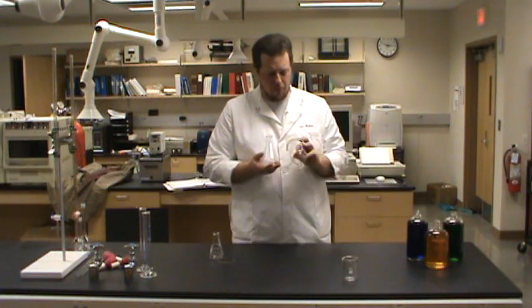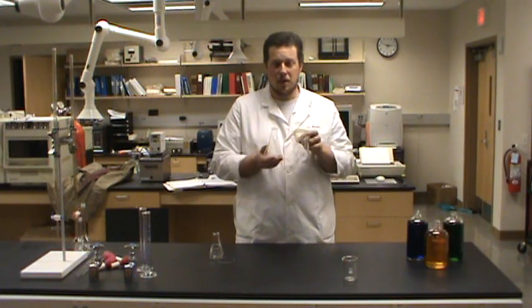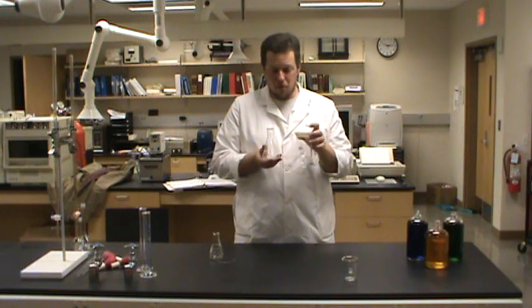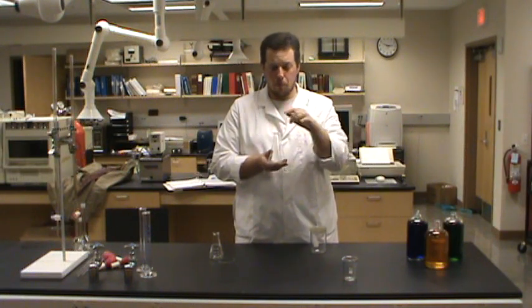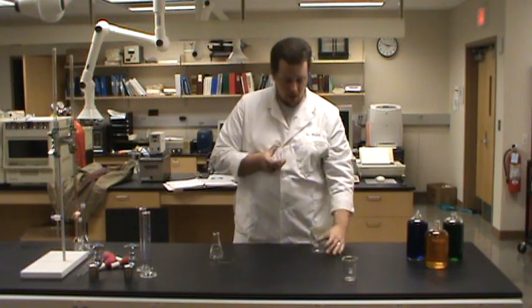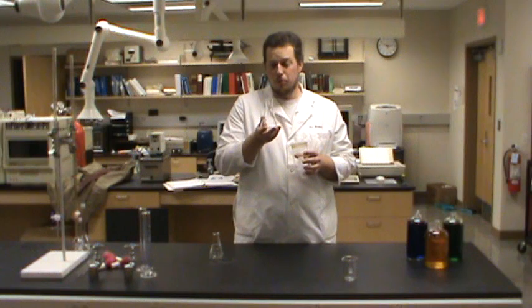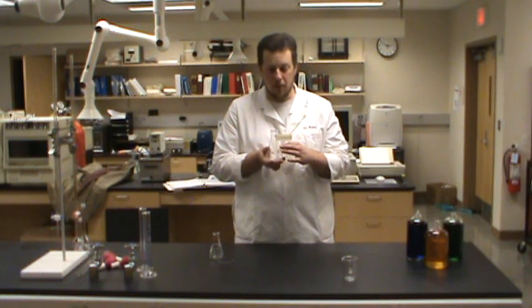The shape is what really matters when we're looking at an Erlenmeyer flask. One thing that we can do with an Erlenmeyer flask that's a little harder to do with a beaker is to just cover the top or put a stopper in it. It's much easier to find a stopper that's this big around than one that's this big around. So if we want to put a stopper on a solution for a little while, an Erlenmeyer flask is probably a little bit easier.